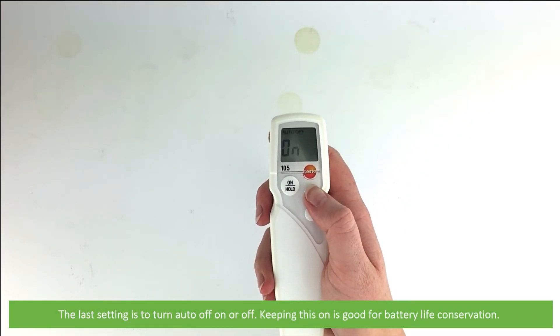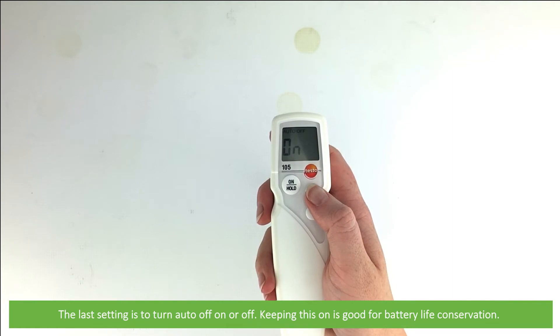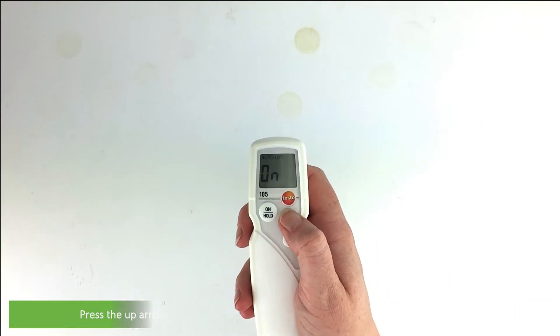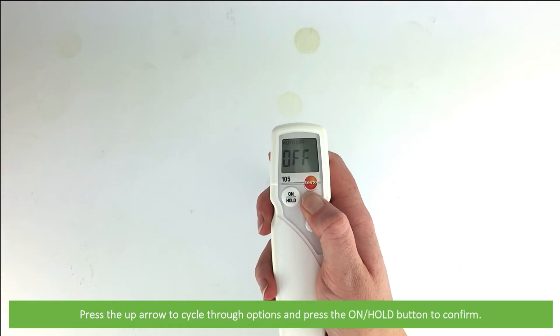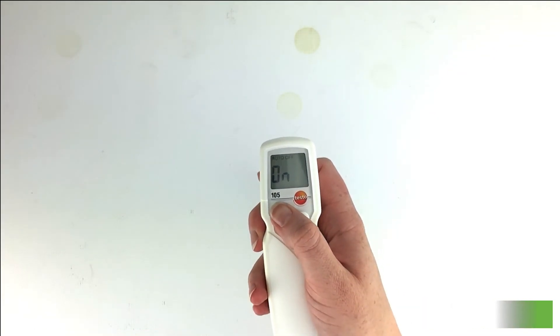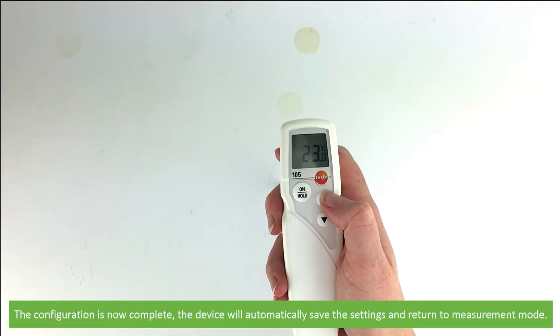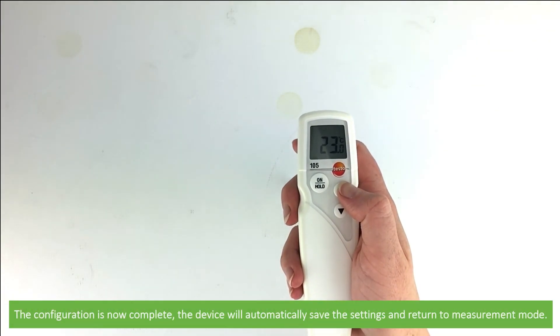The last setting is the auto off function turned on or off. Keeping this on is good for battery life conservation. Press the up arrow to cycle through the options and on hold to confirm. The configuration is now complete. The device will automatically save the settings and return to measurement mode.